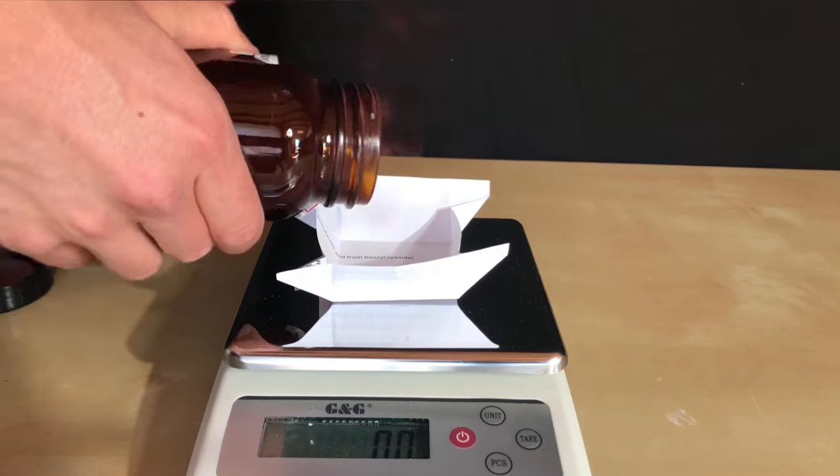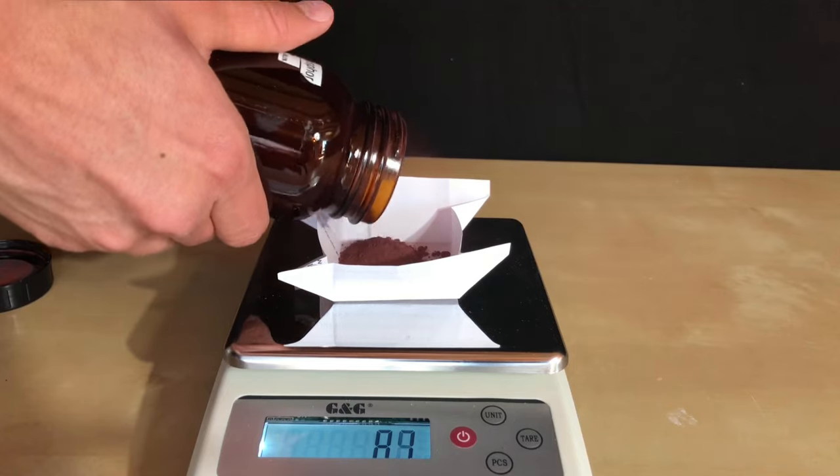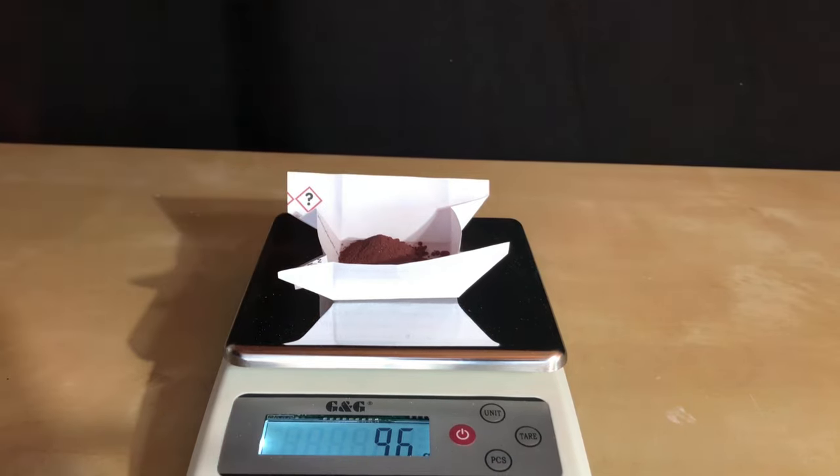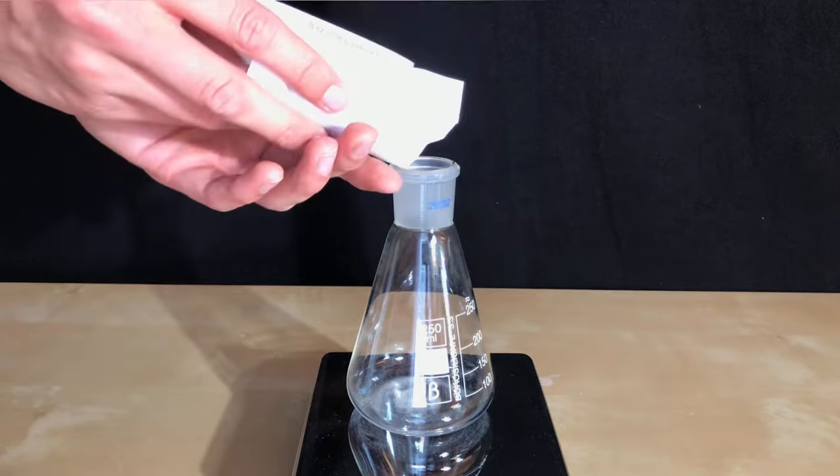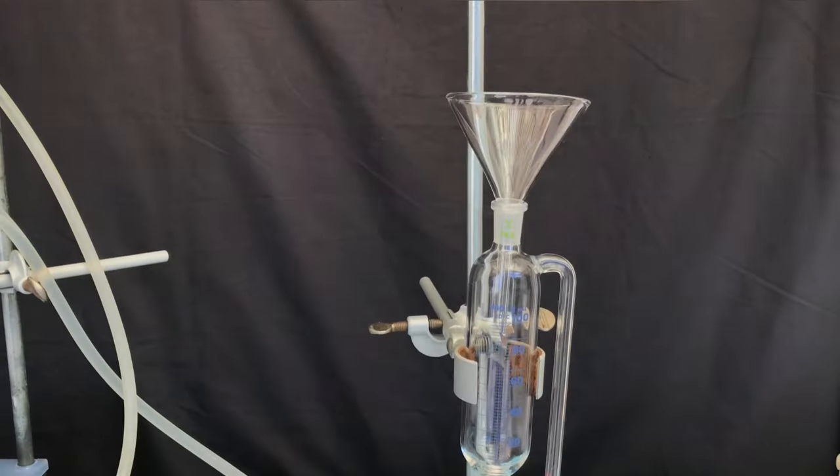We began by weighing out about 10 grams of red phosphorus. As we are using a huge excess anyways, the exact amount doesn't matter. All red phosphorus was added to a 250 milliliter Erlenmeyer flask. A smaller flask might have been a better choice.